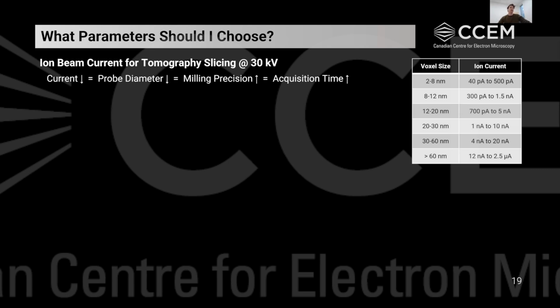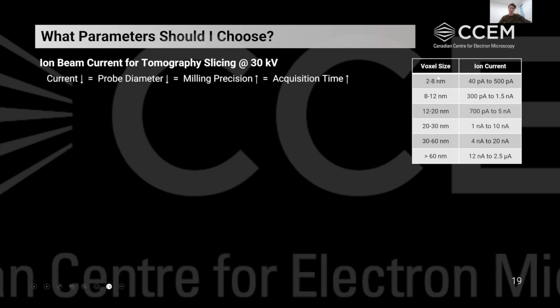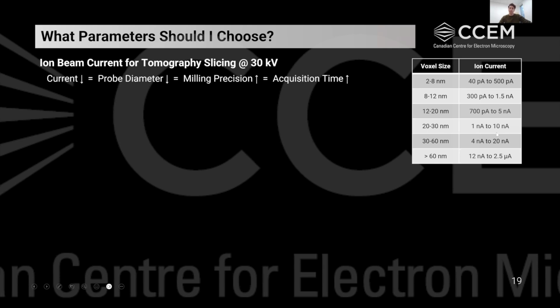And I have a table here of some recommended ion currents that we can use depending on our voxel size. So typically, if we want to push for higher resolution, we want to use lower ion currents. If we're okay with a larger voxel size, then maybe we can use a higher ion current for that.